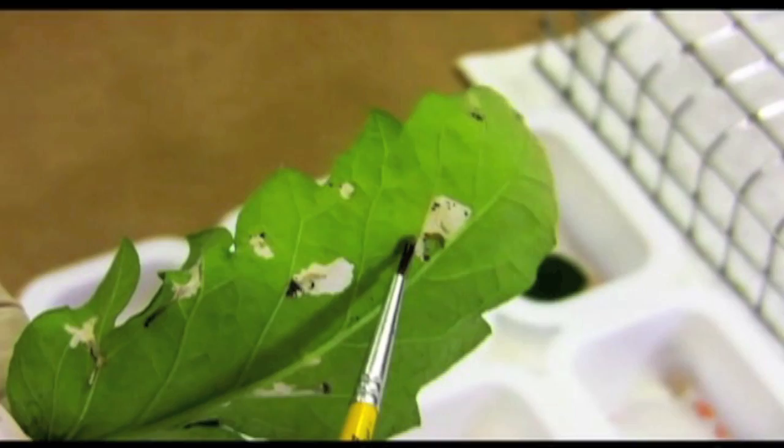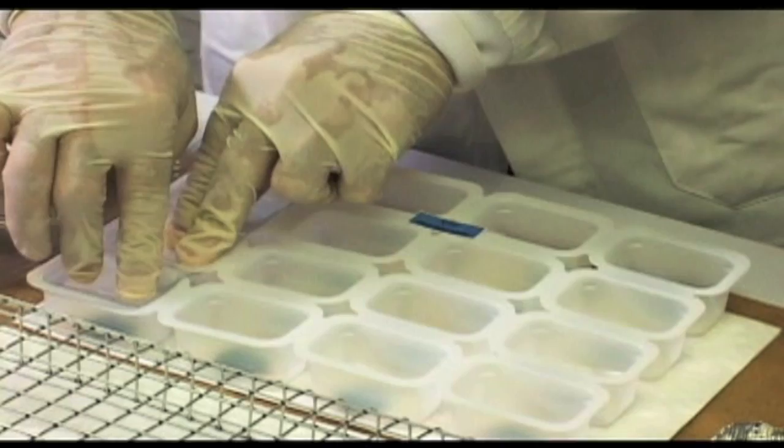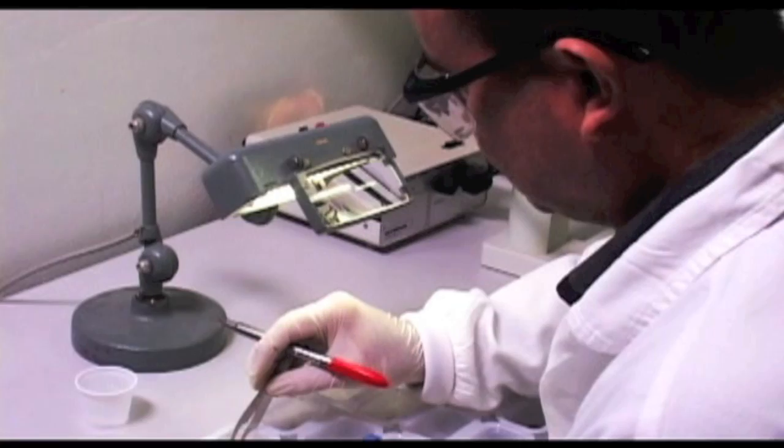Each prepared cell should only receive one larva. Once larvae are in the cells, trays should be closed, making sure that the larvae are not damaged in the process. Trays should be kept at a constant 25 plus or minus 1 degrees Celsius for three days, or 72 hours.